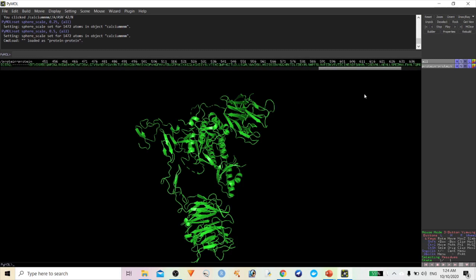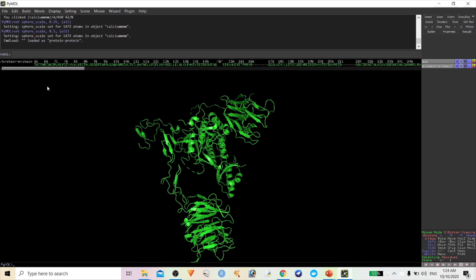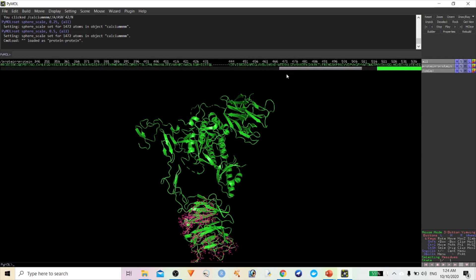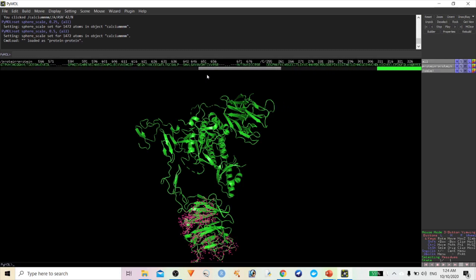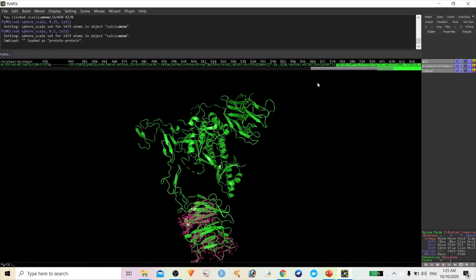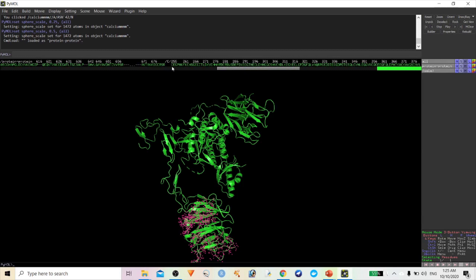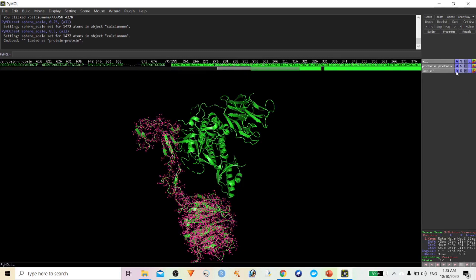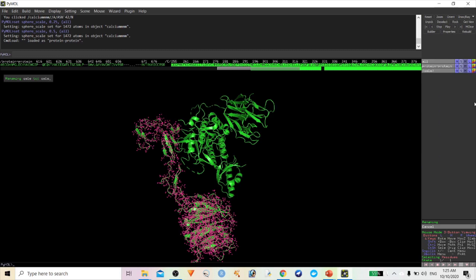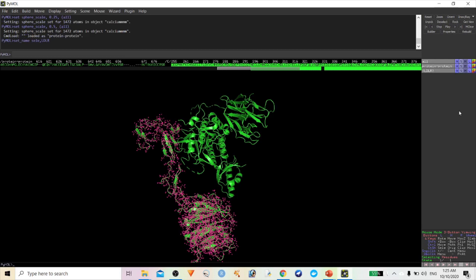First, you have to select one specific chain. Let me select the LDLR receptor — that's chain C. Rename the selection as 'ldlr'. Now let us find what type of interactions and which surrounding amino acids are interacting with this one.